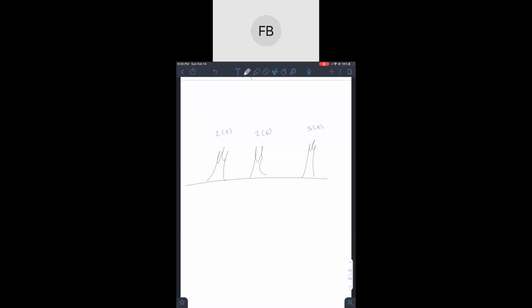All right, so what is this? It's C3H7Cl. That's the formula he gave us. Yes, and that formula is very important, because we can't figure it out without it. I mean, we could, but it would take much longer. So what do you think we do? I think you can see that there aren't any degrees of unsaturation, because there are 7 H's plus 1 Cl, which makes 8, and that's already 2n plus 2. So we just draw our 3 carbons, and now what?